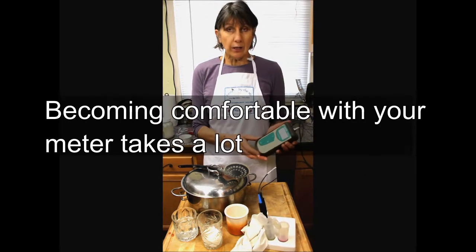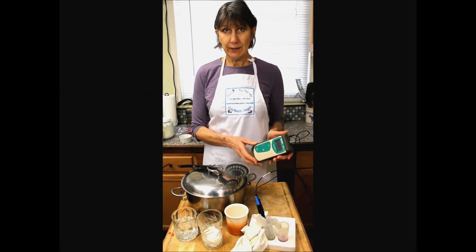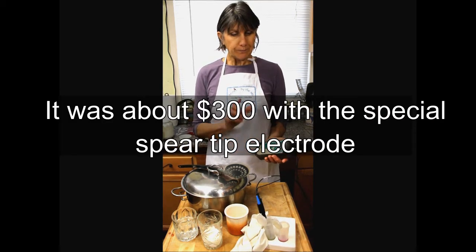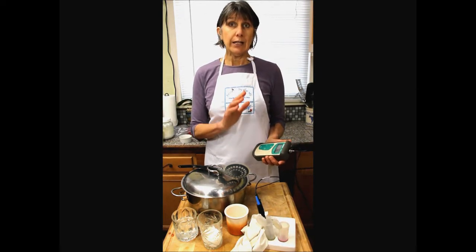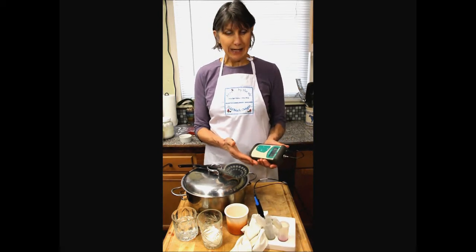This is the pH meter I had for our commercial cheese making. I love it. Got it from Nelson Jameson. Fairly reasonably priced for what you get. And with a pH meter, you do get what you pay for. The more you pay, the faster it's going to be, and the more accurate, simply because it will help you know when it's actually done reading the pH.